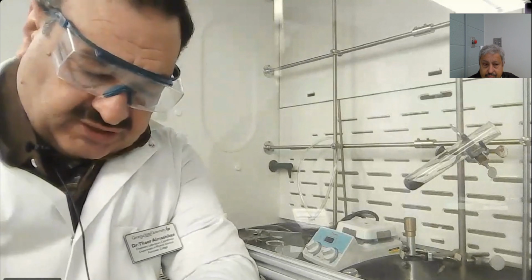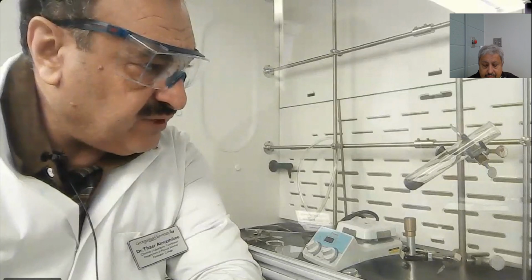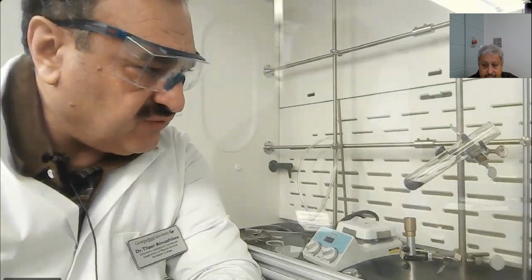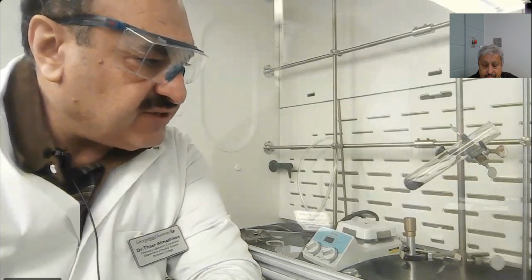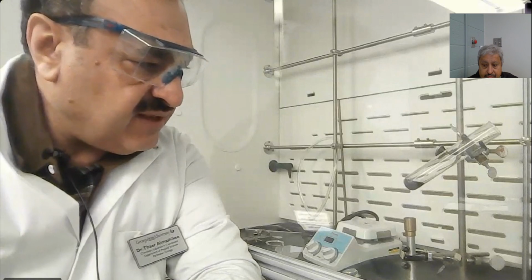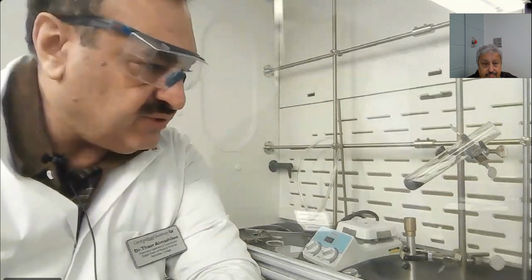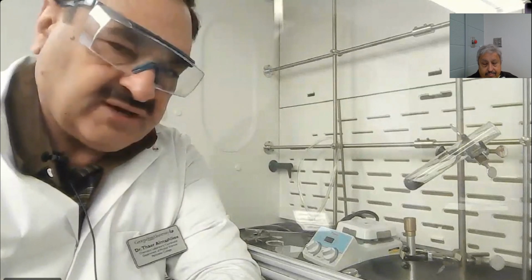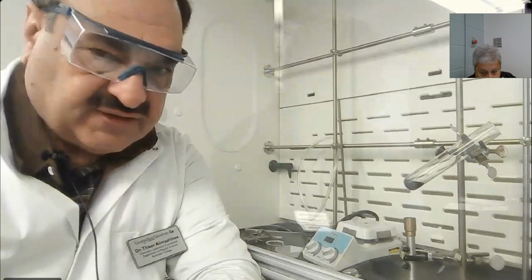I just need to wait another 5 minutes, and then I will wait for the test tube to cool down for 5 minutes, and I will measure the mass of the mixture, and I will stop the recording. But you need to proceed with your second and third run if you have any differences between the first and the second.